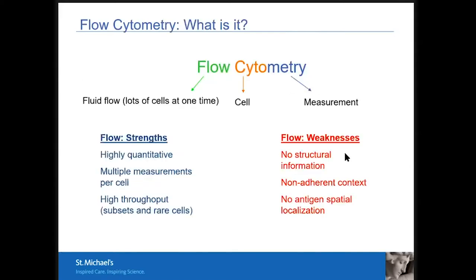because I can't otherwise do that in 20 minutes. So flow cytometry is very useful because you get to look at individual cells one at a time, like Mike had introduced. Averages can be very misleading. We want to see all of the different individual cells as individual data points. And we can analyze them very, very quickly, and we can do it in a highly multiplexed manner. So we get our fluorescence.